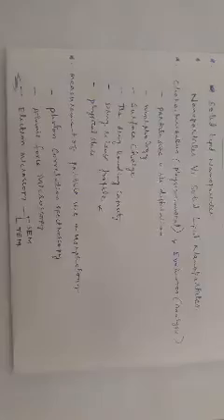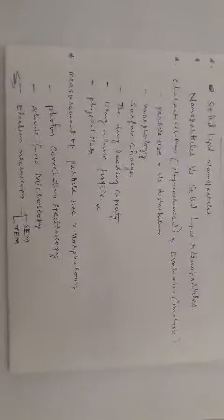So we get the data of size and size distribution of particles, size of molecules, electrophoretic mobility values, and zeta potential values by using these two principles. This data is often critical for establishing as well as optimizing the sample integrity and stability, including the detection of aggregates or agglomerates, which are nothing but the same, that may be present in the dispersion or solution.